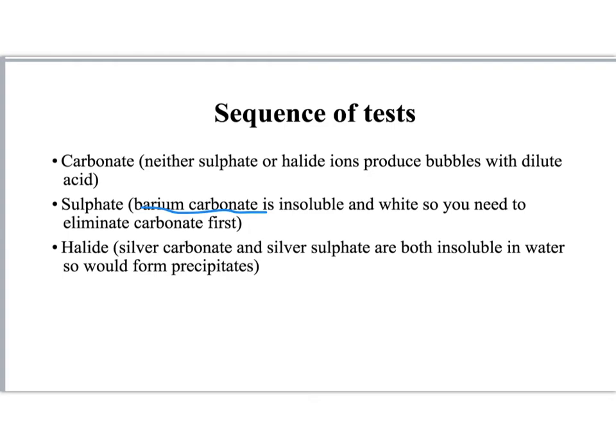Okay, so because I've done this one last, I've eliminated carbonate and sulfate, and therefore I'm just testing to see whether I've got chloride, bromide or iodide there. So remember, carbonate, then sulfate, then the halide test.